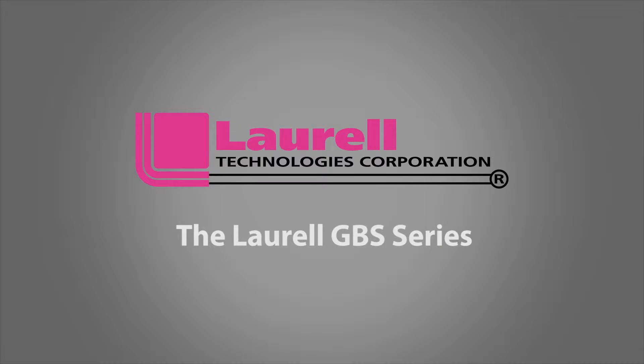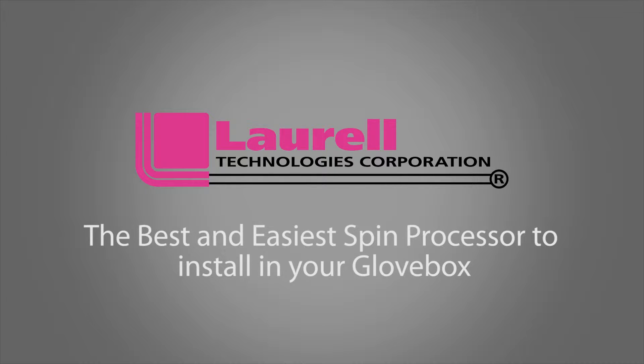Introducing the Laurel GBS series of spin processors. The best and easiest spin processor to install in your glove box.